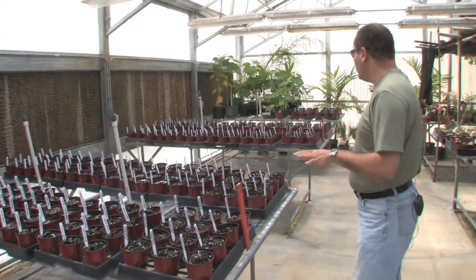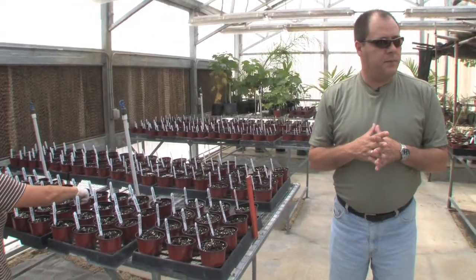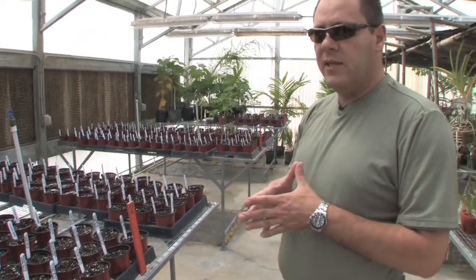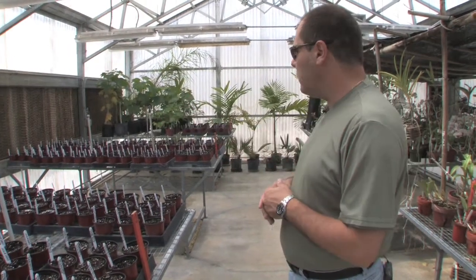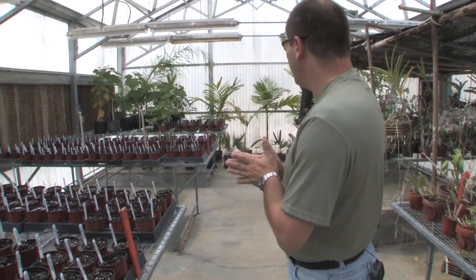So it works really well, and we have over 500 plants that we're going to be germinating here for research. We have more seed material that we can use for germination further along as the experiment goes — if we want to increment, we have more material. So this is what's going on — we're making some progress.